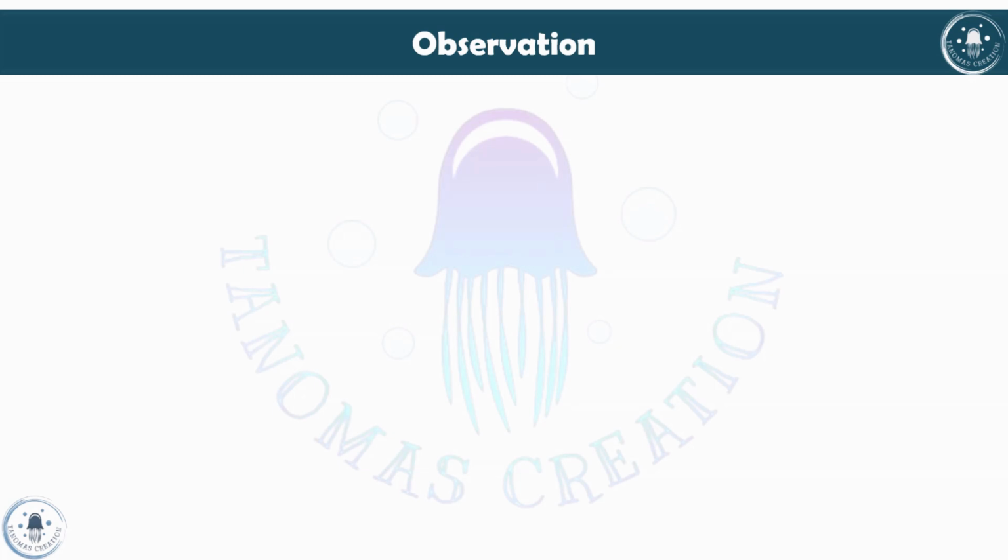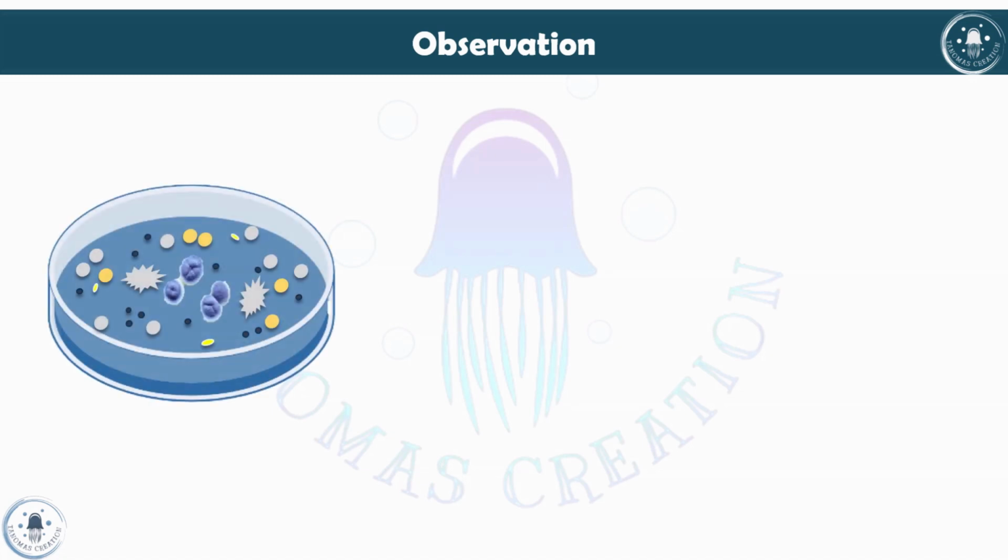So what can we observe after the incubation period? Okay, so what is expected in the observation actually? So the plate which is shown in this picture, we can expect this type of microbial growth. Here in this plate we can see there are different types of microbial colonies that have grown. Based on their morphological characters we can identify it and we can count it. So here the total plate count is done by counting the number of colonies based on their morphological characters.